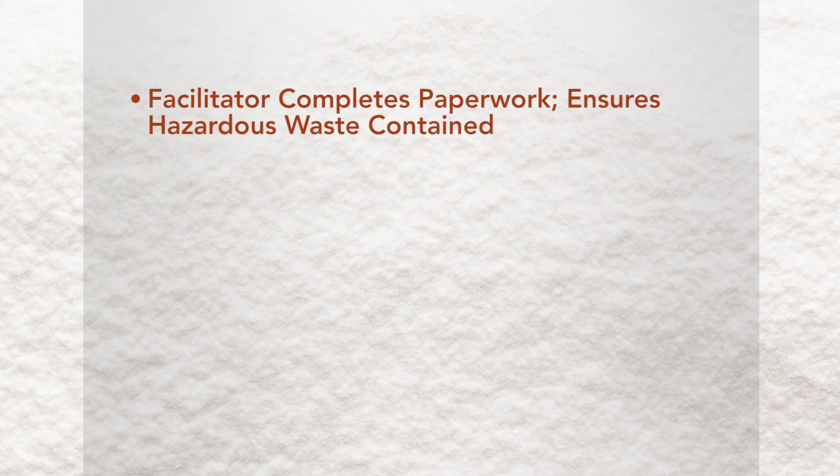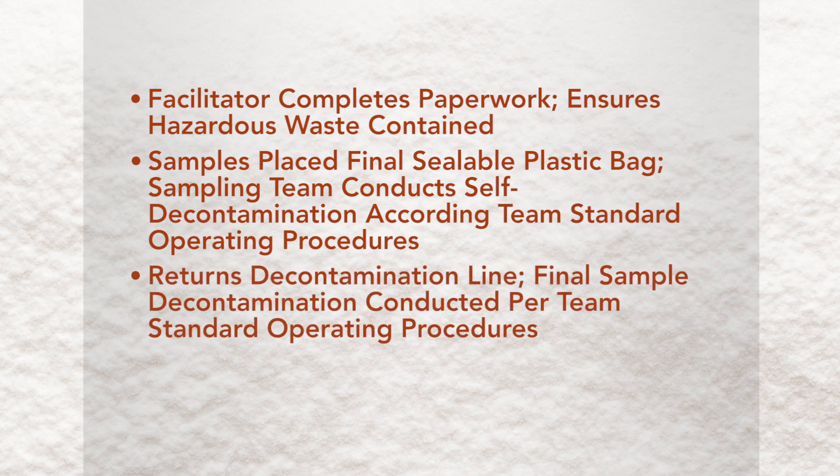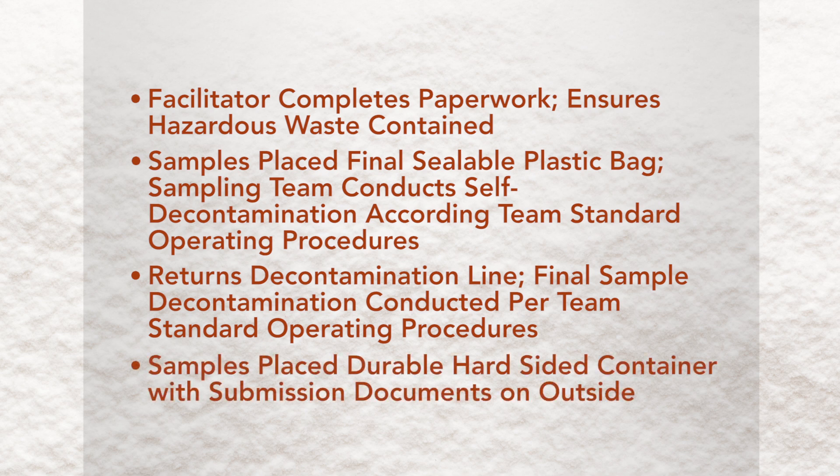The facilitator then completes all necessary paperwork and ensures all hazardous waste is contained. Samples are placed in a final sealable plastic bag and the sampling team conducts any necessary self-decontamination according to the team's standard operating procedures. The sample team returns to the decontamination line and final sample decontamination is conducted as per the team's standard operating procedures. Samples are then placed in a durable hard-sided container with submission documents on the outside.